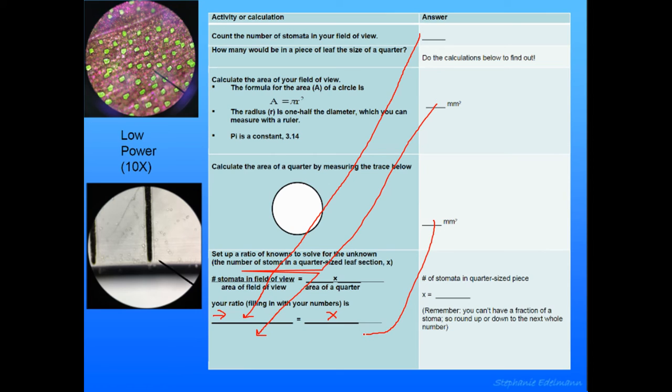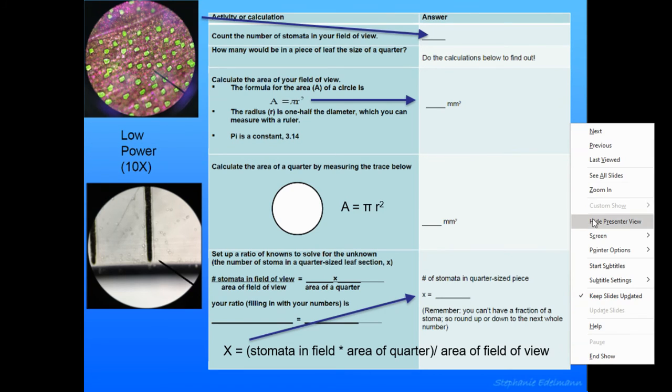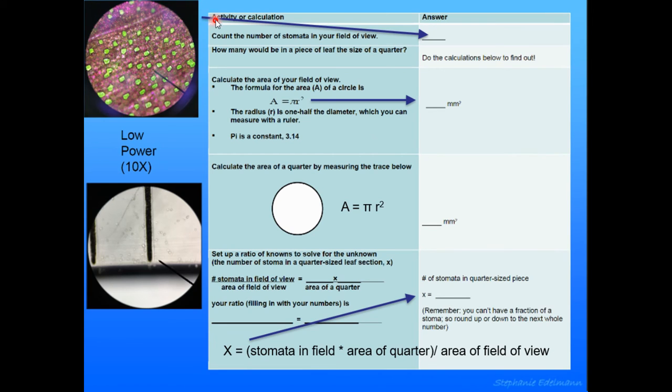And then the number goes in here. Again, because math is scary, we need to be able to figure this out. This number from in here goes in there. You calculate this in here.